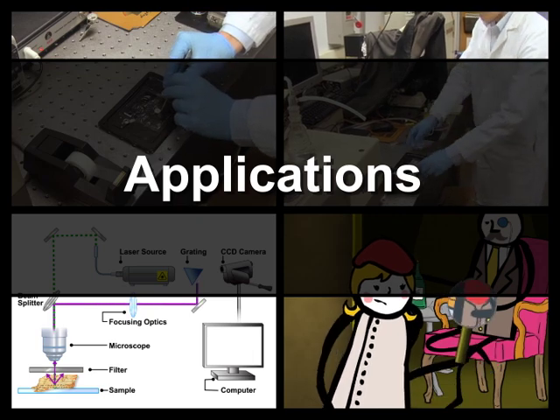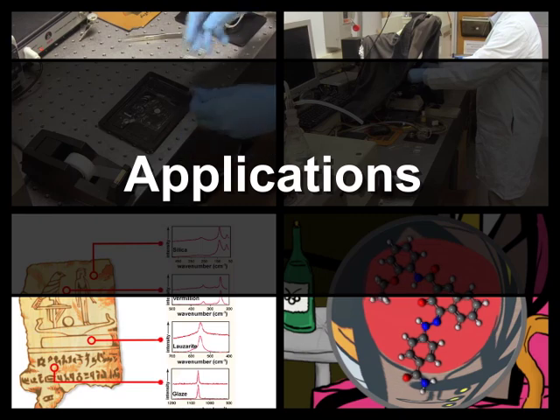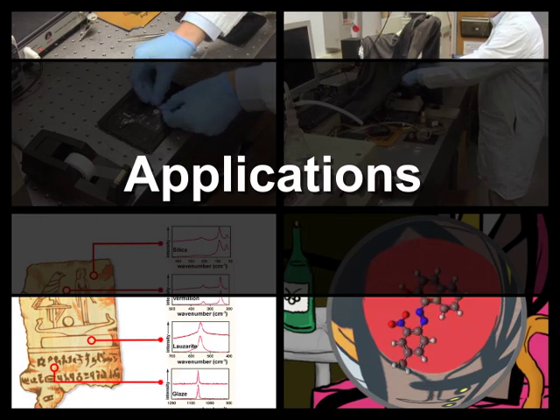Developments in lasers and computer technologies have made the once tedious Raman spectroscopy one of the most widely used techniques for chemical analysis.